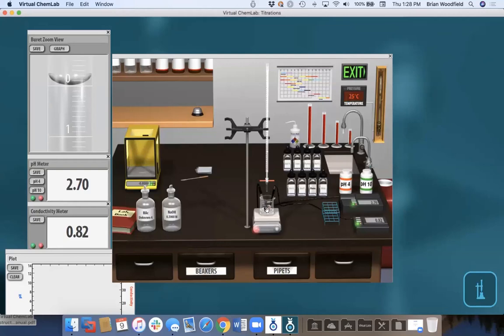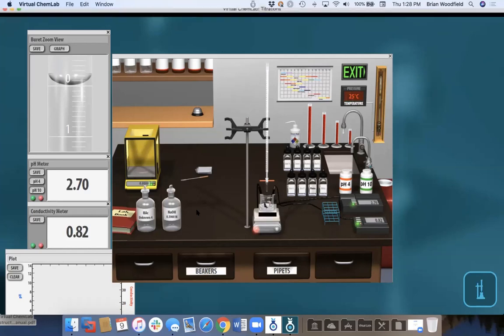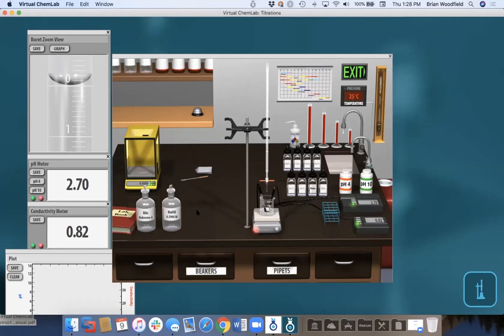And the way we set up the pH calculation is we set up a mass balance, charge balance equation that was a general solution for up to a triprotic acid and a tribasic base, including activity coefficients using the extended Debye-Huckel theory, and adding in partial molar volumes, so that the volume mixing is not additive, that we actually take into account the interactions between all of the ions in solution, so that the solution additivity is also correct. So this is about as accurate of a calculation you're going to get.